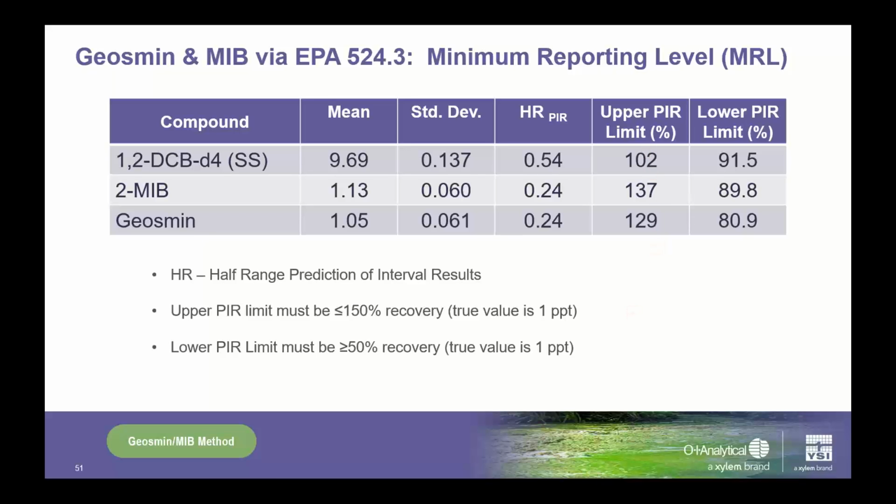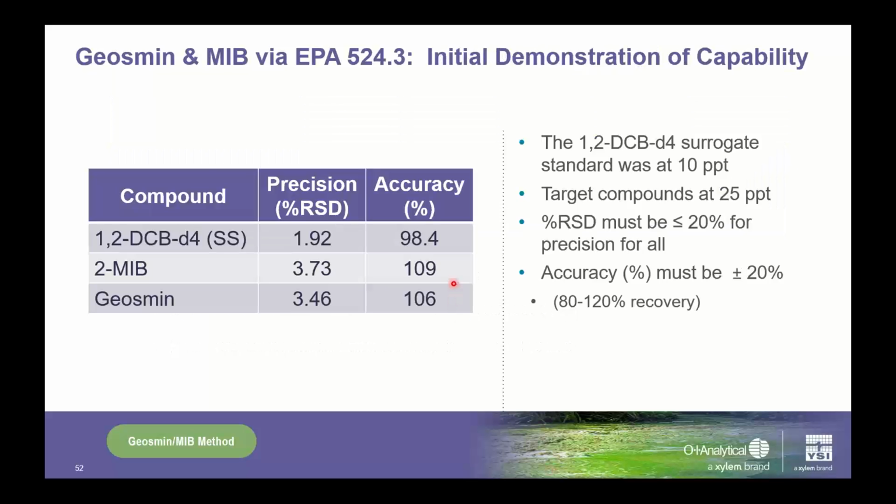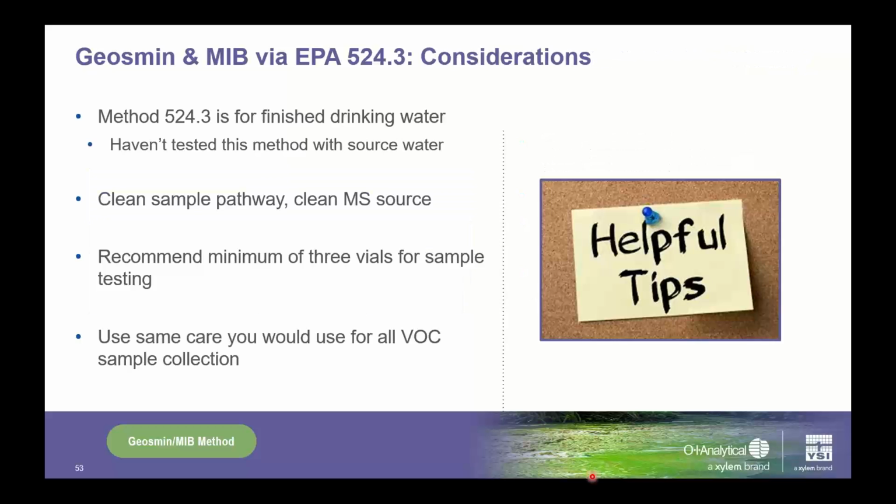And I'm noticing I'm running up against time, so I'm going to just go through these last initial demonstration of capability results, where we are also hitting all of the targets that are prescribed by this method.